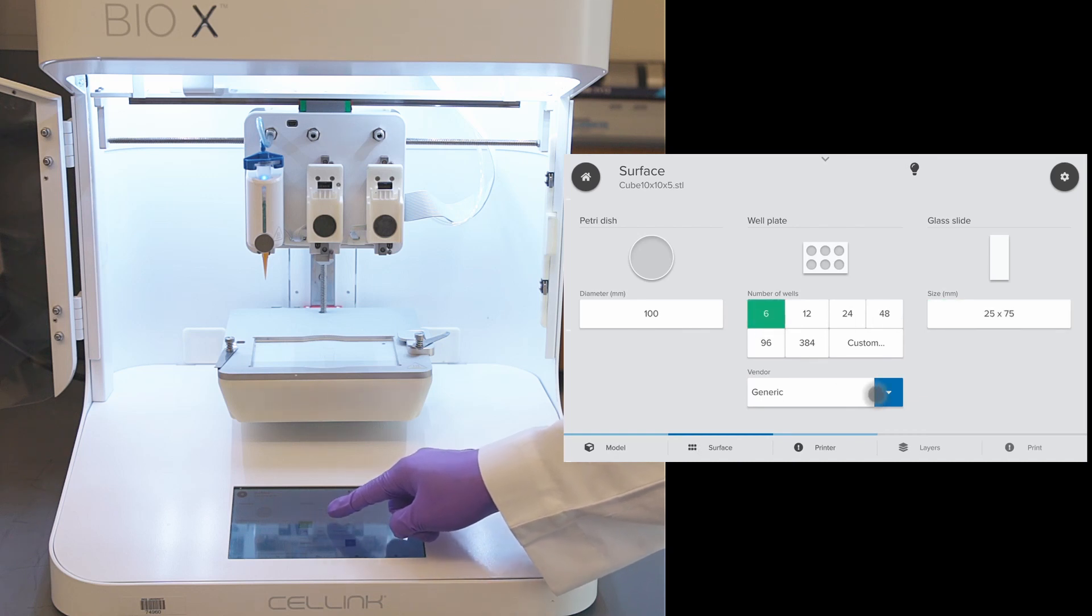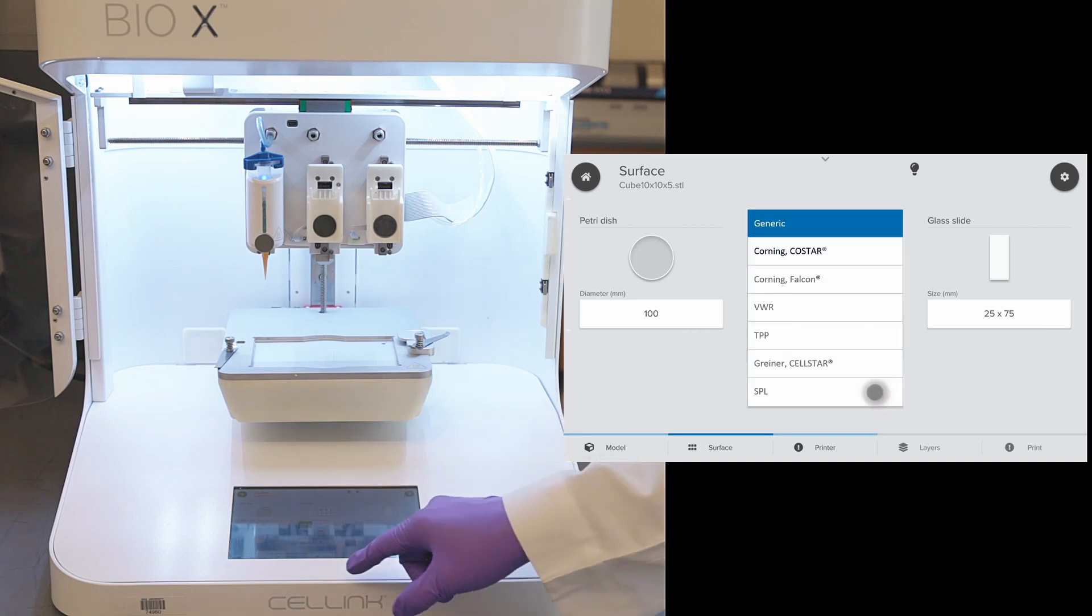Using a 6-well plate, we can define the object to be printed once and the printer will replicate 6 times in each well. We can choose the appropriate vendor to accommodate for slight changes in the well dimensions and spacing.